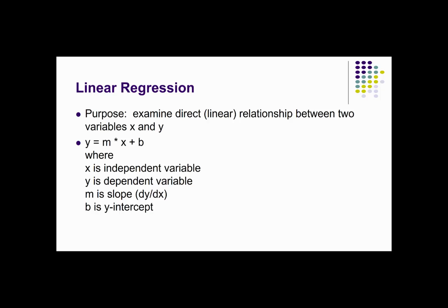And I want to mention that though we're focusing here on analysis of a UV-vis curve, we can apply the same concept to other analytical techniques as well. This could be, for example, electrochemistry, where we could be generating a calibration curve.